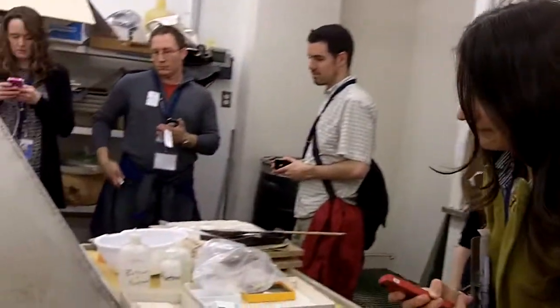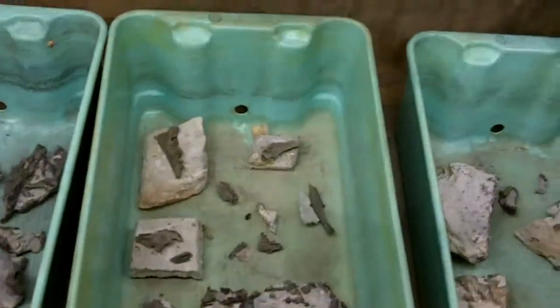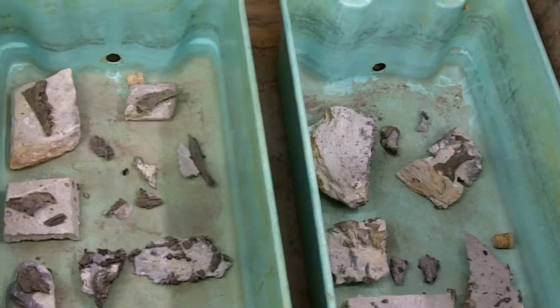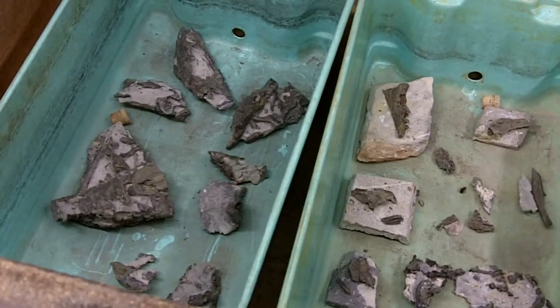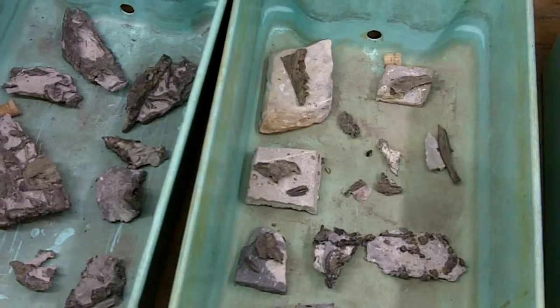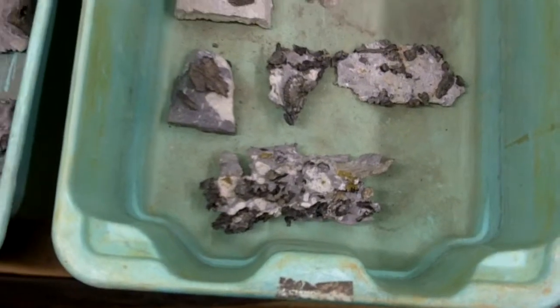If you take a look in any of these tanks around here, you can see there are some limestone blocks in each one of the basins, and they have different stages of preparation on these little swimming creatures called thalattosaurs, which are about 250 million years old, 240 million years old, somewhere in that range. How do you spell that? Phonetically? T-H-A-L-A-T-T-O-S-A-U-R, thalattosaurs.